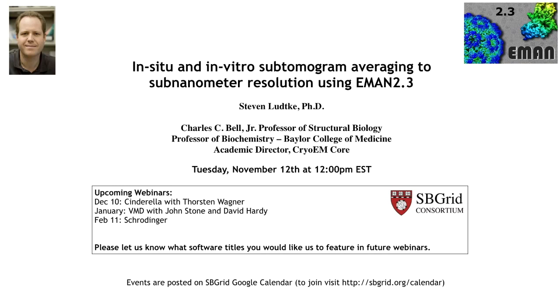Thanks for joining today. I'd like to introduce Steve Ludtke. Steve's coming to us from Baylor College of Medicine in Houston. So today he's going to tell us about the per particle, per tilt subtomogram averaging pipeline in EMAN2.